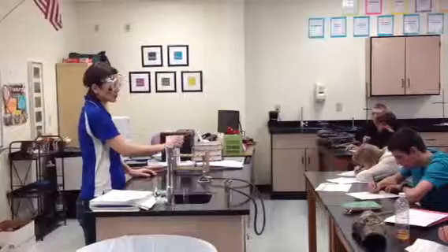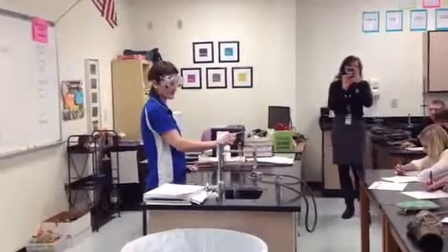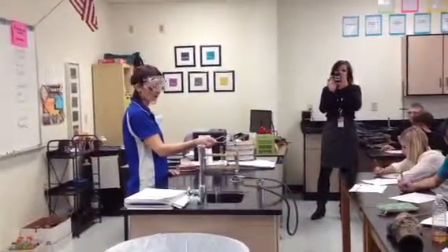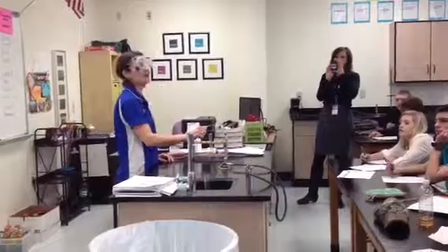What color do you normally associate with copper? Like a bronze. Why is this one green? Because it's a powder. Well, copper turns green when it ages. There you go. Copper does turn green when it reacts with oxygen. Have you ever seen green on a penny? The Statue of Liberty.